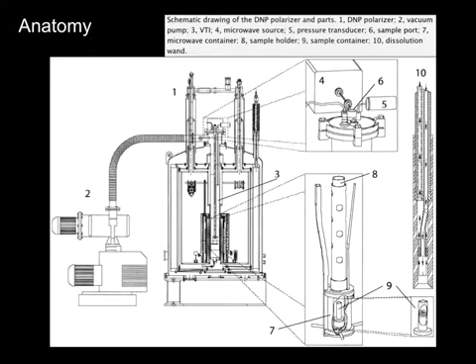And so if you look here, there's 2 tubes. There's one that brings the heated solution down from the bomb and then into the sample cup. And then there's another tube that takes the dissolved sample out, and then that will go out through a tube, and then you can collect that liquid state polarized sample and then bring it to your living system of interest and do your hyperpolarized experiment.